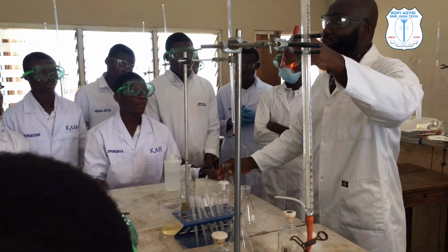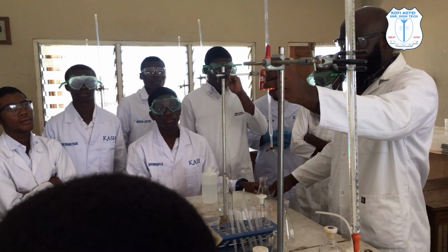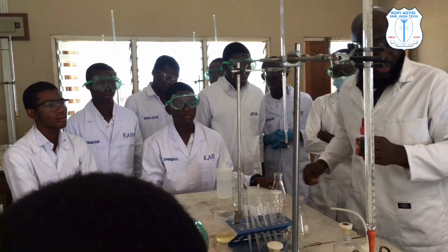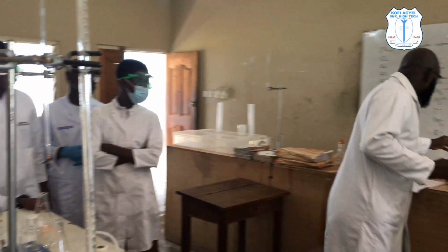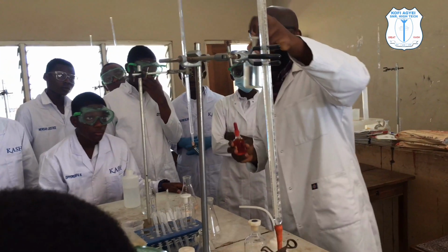This one is the methyl orange indicator. So with acid-base titration, we normally use two indicators. So mostly we use what? Methyl orange indicator or phenolphthalein.